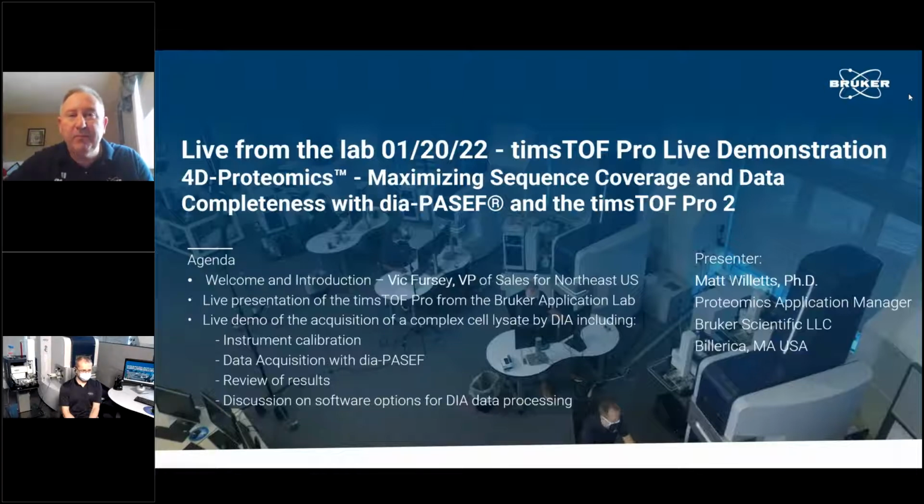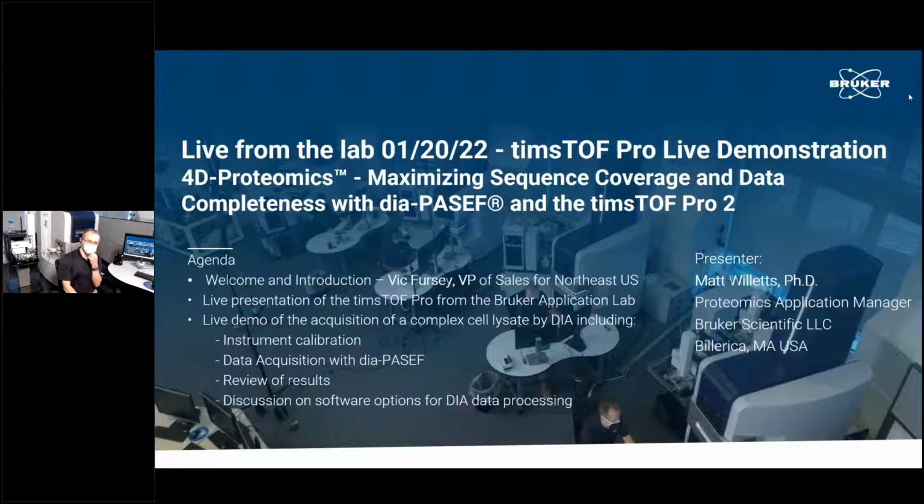Thanks a lot, Vic. Hi everybody. As Vic says, we're here in our demo facility in Billerica, Massachusetts, and I'm going to take you through the acquisition of a complex cell lysate sample using our dia-PASEF workflow.